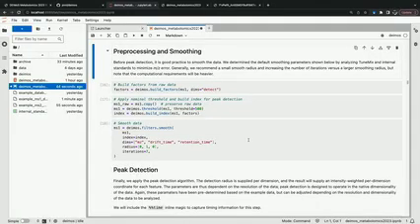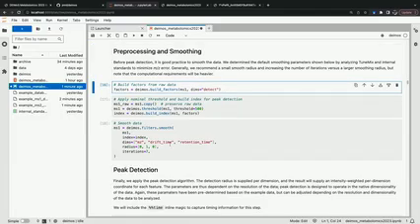Great. So now that we've visualized our data and loaded and saved it, before proceeding to peak detection, first we perform smoothing. We've here included smoothing parameters that we've by default determined using lots of tune mix data and iterating through different parameter sets. But of course, those can vary based on your own data, and so that can be adjusted to suit the user needs.